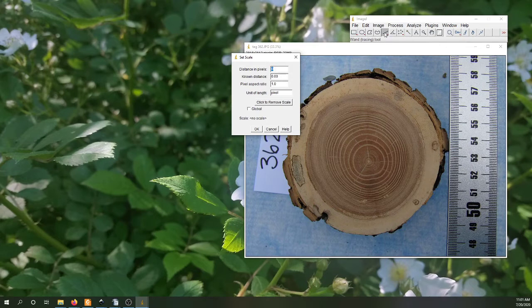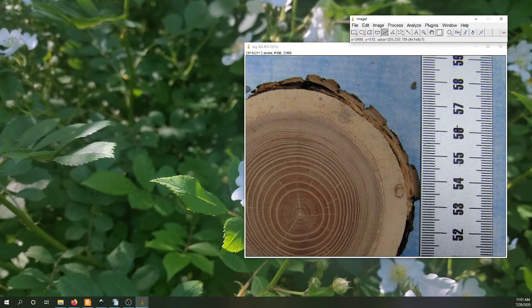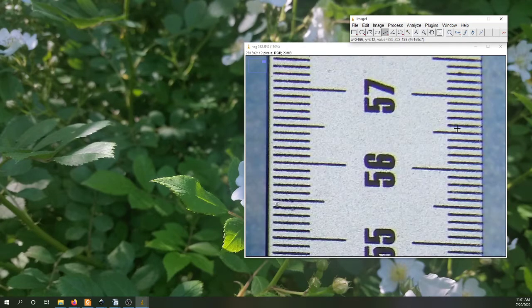So we're going to use our drawing tool. Whoops. Let's do that first. And you can zoom in and out using plus and minus keys. Or if you have a mouse with a scroll wheel, you can press Control and roll in and out. Either way, let's get down really close to that, and then let's make a line. And we want to follow that fairly precisely. We want to have the same angle so that it's as accurate as we can be.